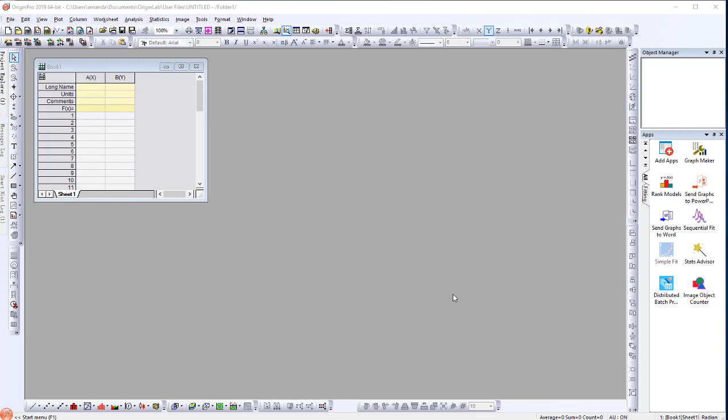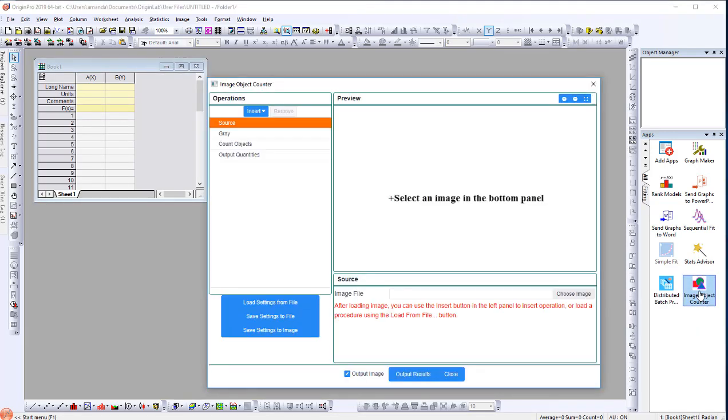The Image Object Counter app is used to identify objects on an image by measuring their characteristics. To get started, click on the app icon to open the dialog. The left panel handles operations performed on the image.